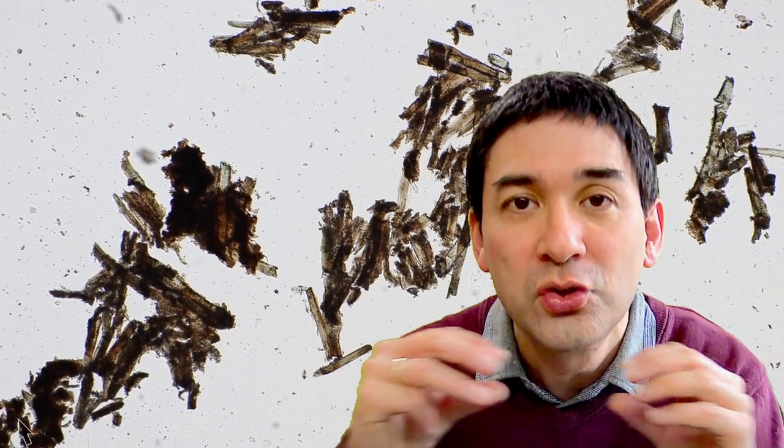We are able to see the individual muscle fibers but they're kind of torn apart and scattered all over the place. We have to look much deeper into the individual muscle cells to see the different structures. Skeletal muscle — which is what meat actually is — consists of long muscle fibers made of many hundreds of cells fused together. These are simply long fibers, ripped apart due to the processing I've done.